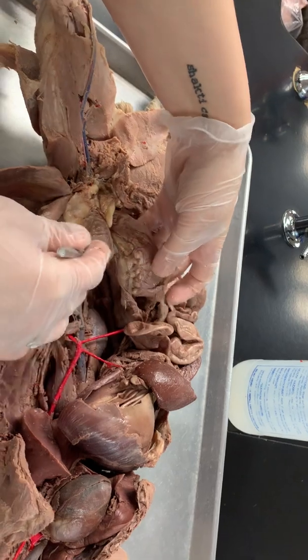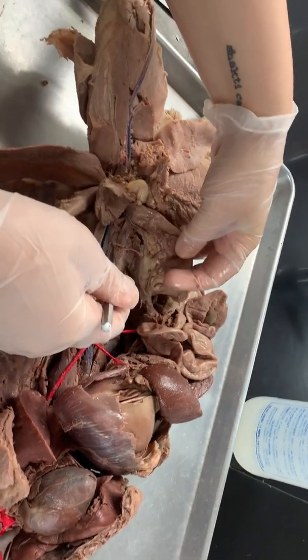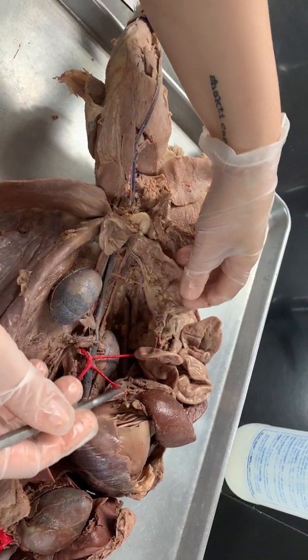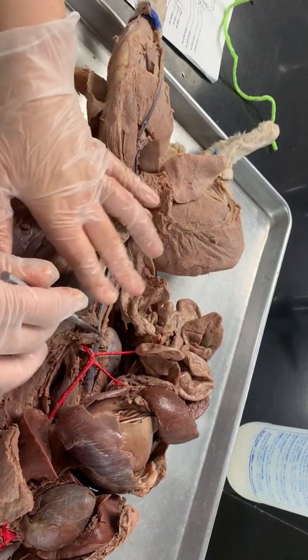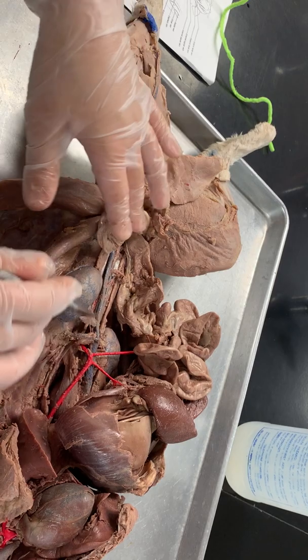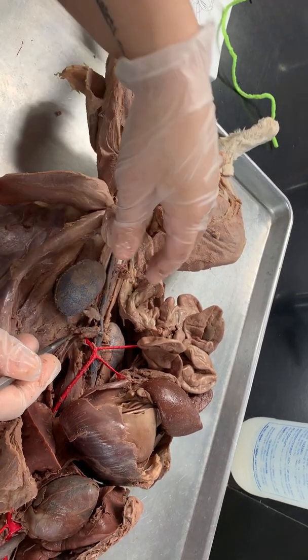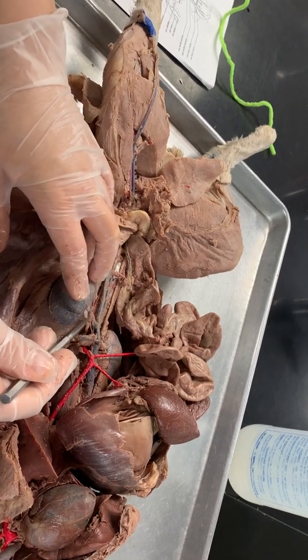Following that down, this is your inferior mesenteric trunk. This would be the left colic going up. Okay. So now let's talk about the veins and the arteries that run together. This is your adrenolumbar. This is your renal.